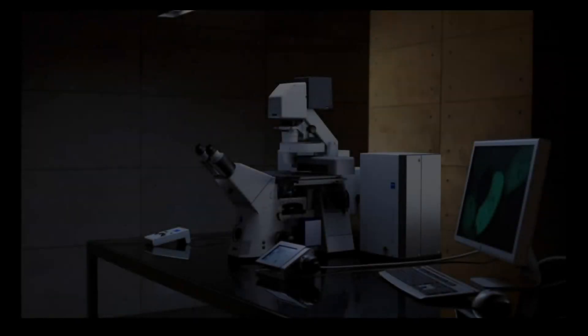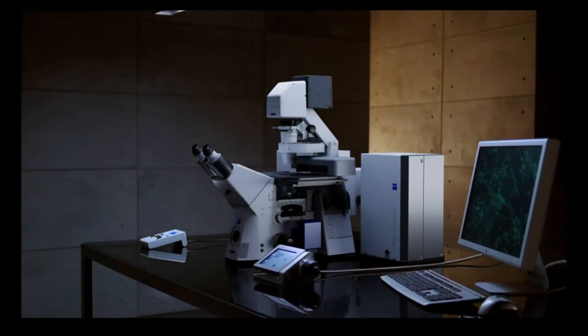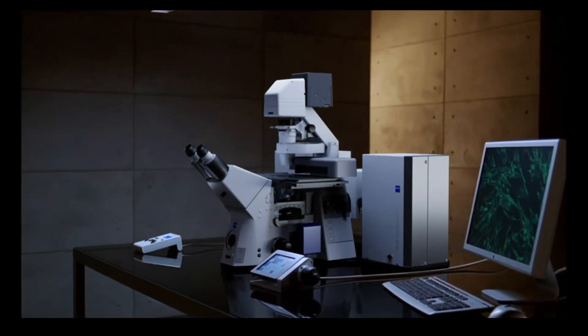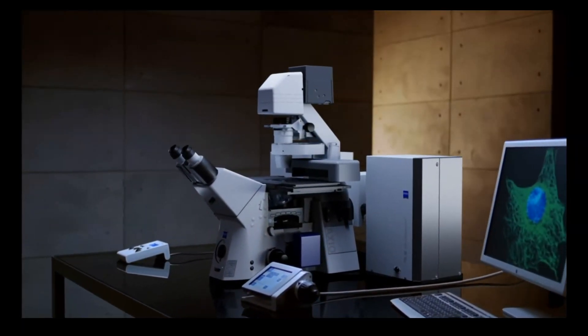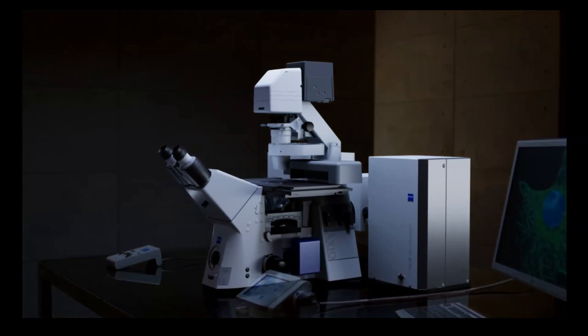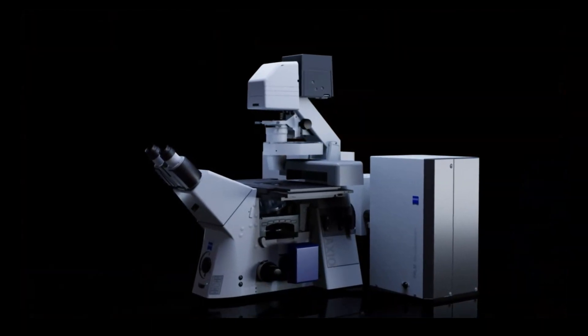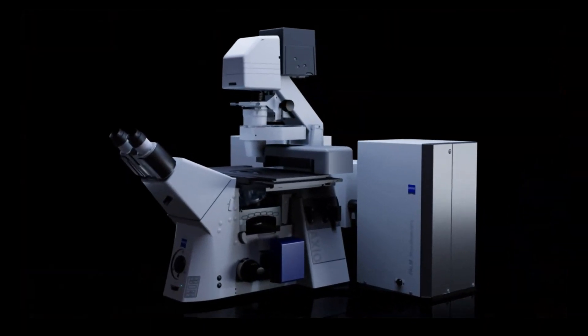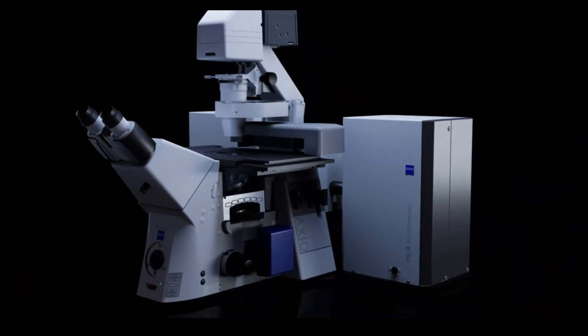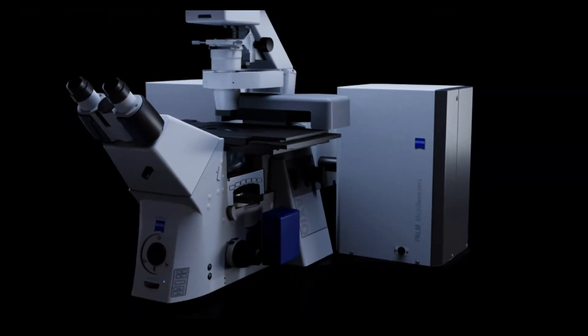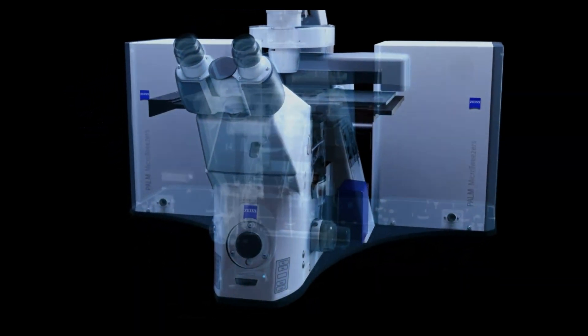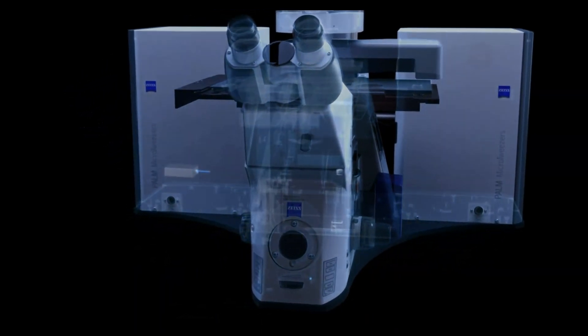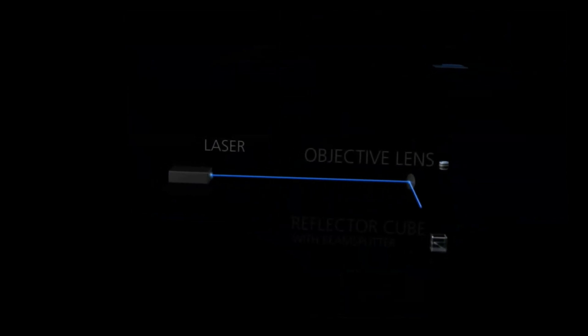The Palm LCM system is built around Zeiss's flagship inverted motorized microscope, the Axio Observer. The ability to use this microscope as a laser microdissection system is provided by the inclusion of a 355 nanometer pulsed UV laser that is introduced through the rear port of the microscope.